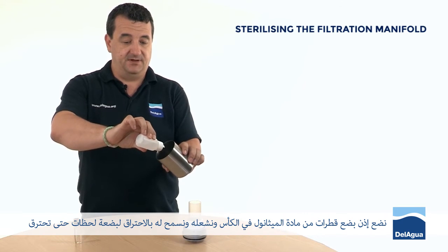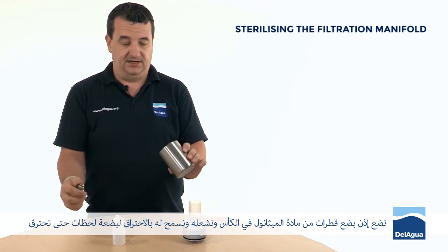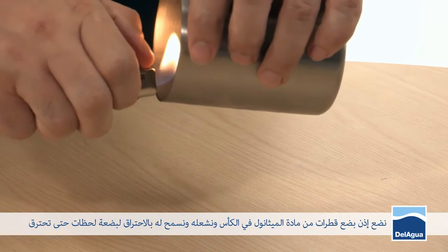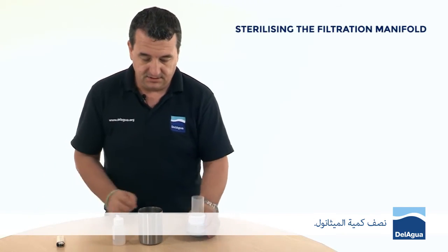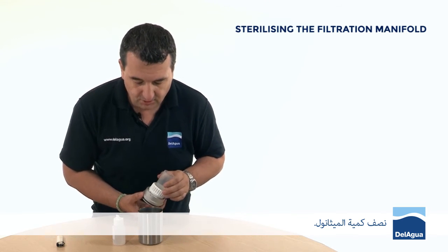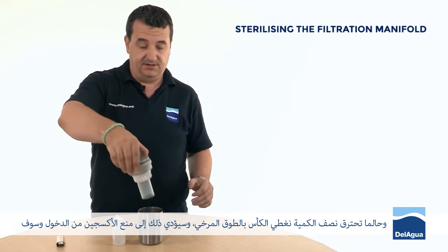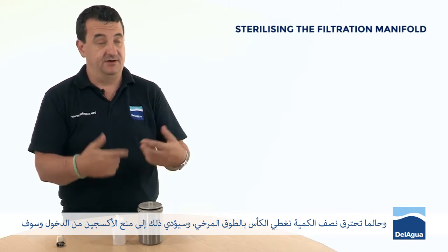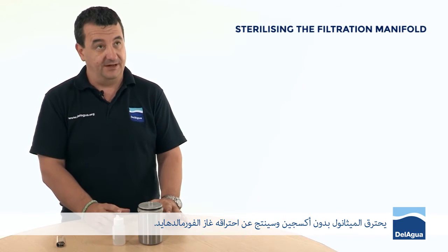We just put a few drops of methanol into the cup and light it. We allow that to burn for a few moments until the methanol is about half gone. Once that's half burnt away, I invert the loose collar into the cup, and that cuts the oxygen out. The methanol will then burn anaerobically without oxygen, and that will produce the formaldehyde gas.